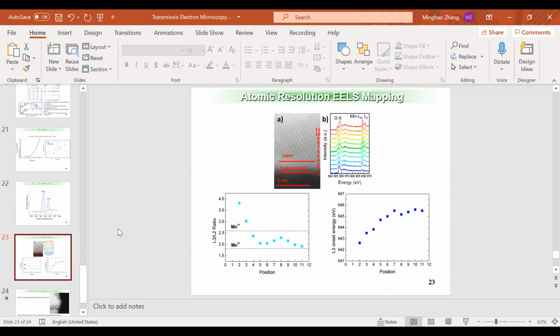But what is typically done in this field is that you want to collect the information under dark current conditions. So what I mean is that you bias your sample, right? And when you bias your sample, you can turn off your beam. You just do the biasing, hold the voltage for a certain amount of time, and then you open the beam. So you can make sure that your electrons do not flow very fast through the imaging process. That's called dark current processing.